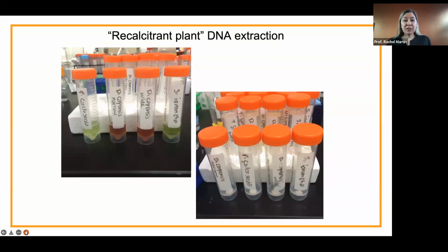So in order to do this, we had to sequence the genome, and I extracted the DNA from this plant myself, which was quite an adventure. The protocols that turn out to be relevant for this use the term recalcitrant plant for plants that are hard to extract DNA from. The reason they're recalcitrant is there are several. They have a lot of pigments in the leaves that have polyphenolic compounds, and they derivatize the DNA and make it impossible to read. And then also a carnivorous plant has nucleases all over it.